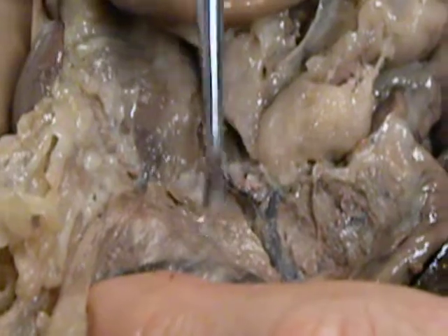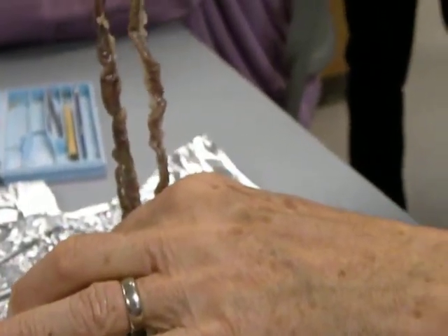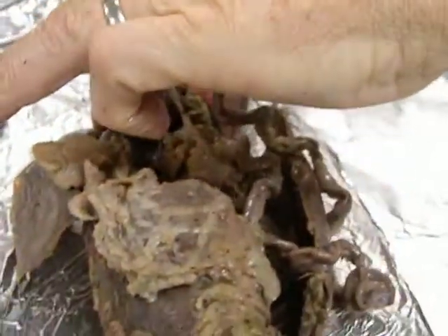Now, just a few more things about this. Well, let me do this again. Take this intestine when you loosen it up and divide it into thirds like this. The first third coming out of this stomach region is called the jejunum, J-E-J-U-N-U-M. The jejunum, first third. Remaining two thirds are called ileum, I-L-E-U-M, and you do not want to spell that word wrong, because I-L-I-U-M is a bone, hip bone, in fact. I-L-E-U-M. So, first third, jejunum, remaining two thirds, ileum.